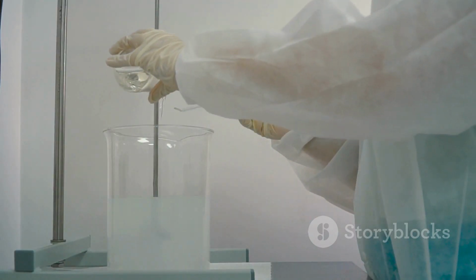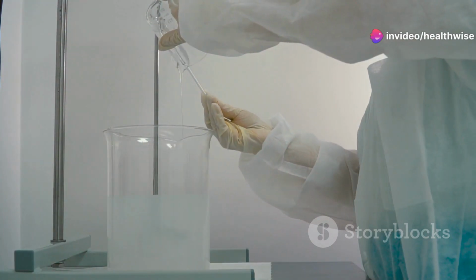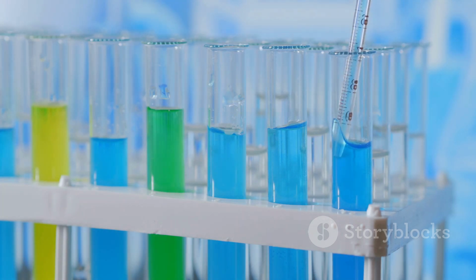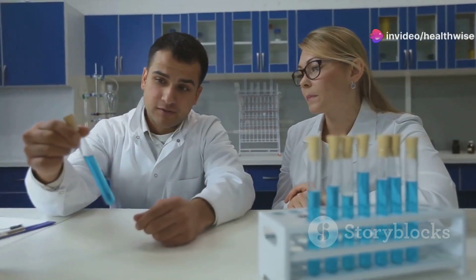In affinity chromatography, we create a stationary phase that contains a molecule called a ligand, designed to attract our target molecule. When we pass a mixture of molecules through our column, only the target molecule binds to the ligand, like a perfect match. All the other molecules simply pass through the column.